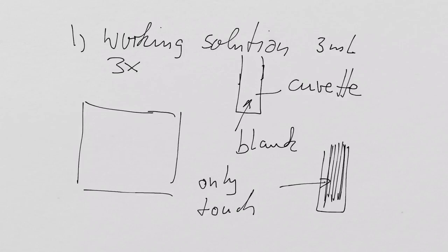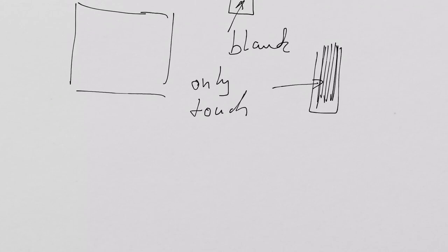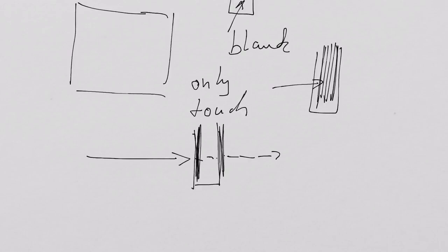Why is that? Because in the spectrophotometer, the light will go through this cuvette and be absorbed by the compound in here, so less light will go through. The light has to be able to go through the clear side. Your demonstrators will help you with that. Then the photodetector will tell you how much of the light is absorbed. The background to that we do probably next week.